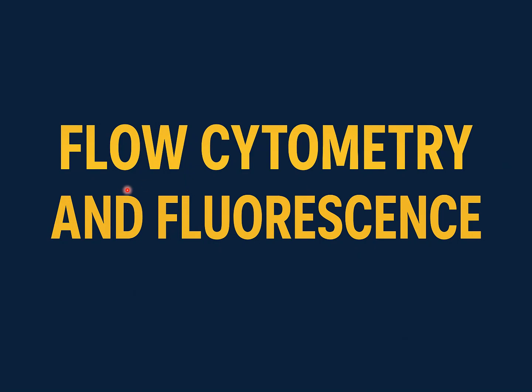Today's topic is flow cytometry and one of its variants, which is based on fluorescence.